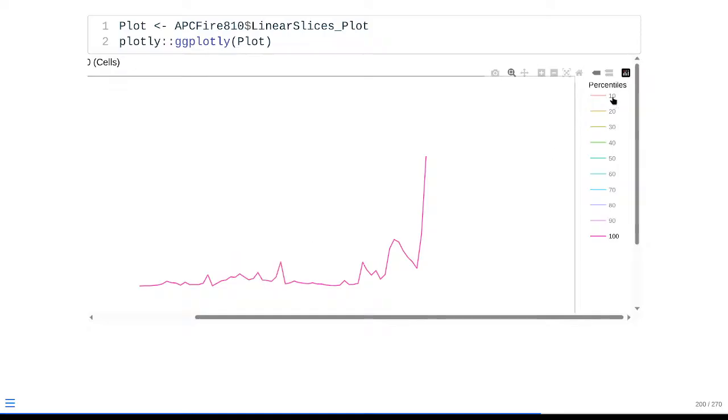Versus if you're gating the dimmest 10%, you would have seen a signature that looks like this by comparison. So there is a little bit of difference in the signatures based on where we're drawing those gates, looks like the violet 7 detector and maybe a little bit on this R1 detector. But ultimately, an interesting thing to note is when we include everybody, for those little bit of autofluorescent detectors, you can see there's a little bit of step ladder appearance as you start including dimmer and dimmer cells into the overall signature.